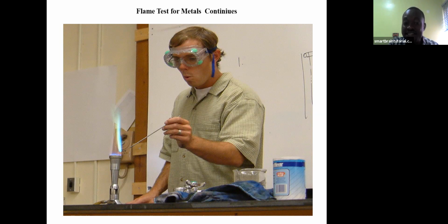You can see it gives a particular color, which is something like greenish yellow with some part of yellow in it. Now, this student is wearing glasses through which you could see clearly, to avoid any cases of accident. So this is an example of how the test is carried out. You can see you don't need anything else, just a Bunsen flame, the platinum wire, and the sample. Here you have a beaker through which the sample is prepared, and here is a container of the particular chemical or compound which is used for preparing the sample.